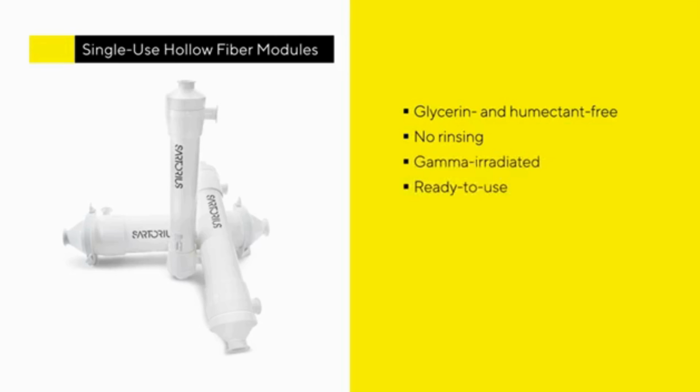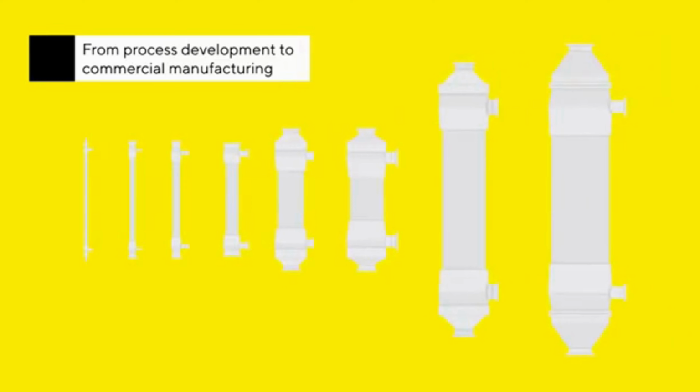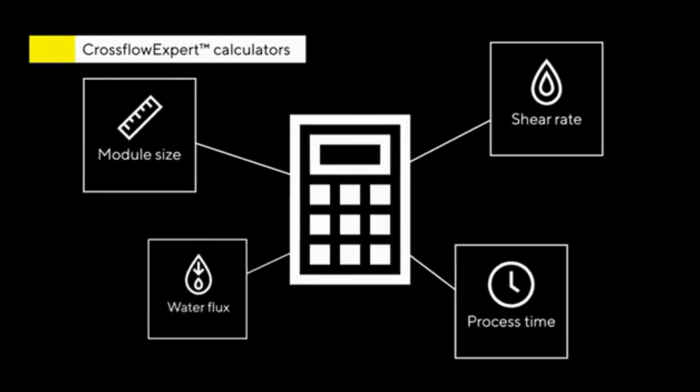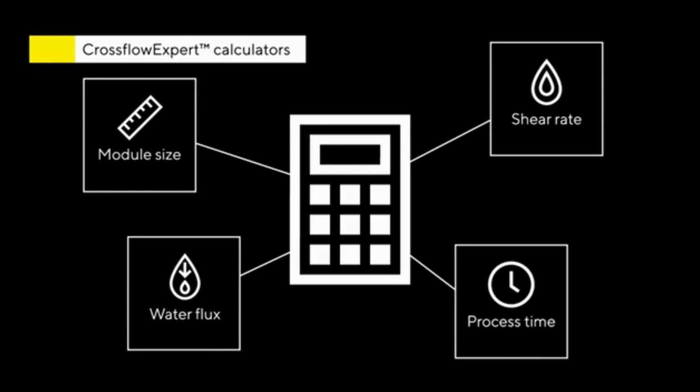Such systems required constant operator supervision to maintain pressure settings, monitor flow rates, document process conditions, and ensure consistent performance. Modern automated TFF systems have transformed bioprocessing by integrating programmable control systems, digital pressure monitoring, automated valves, flow sensors, and real-time data acquisition software into unified platforms.